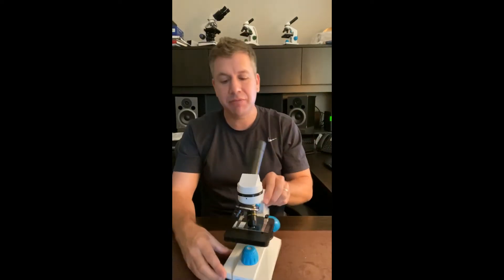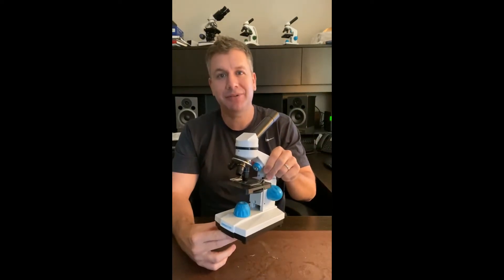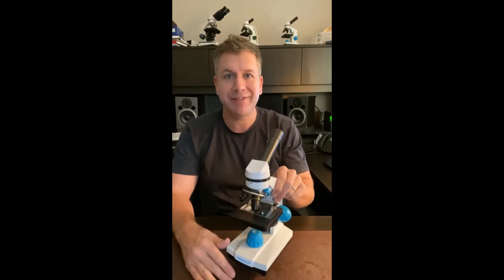Alright, let's get started. The Junior Scope is a compact kid's microscope. It's very easy to use, but there are a few tips that'll make it even easier.